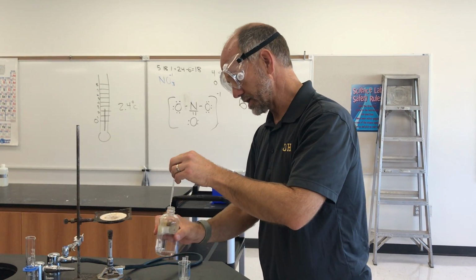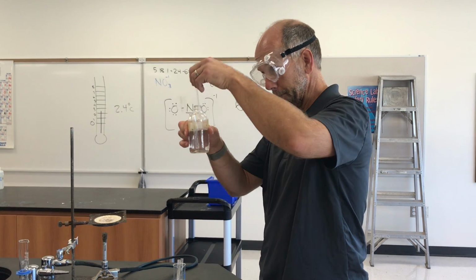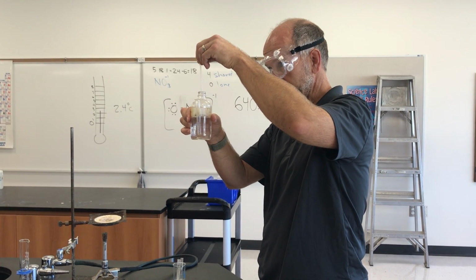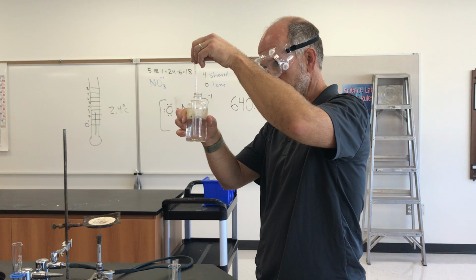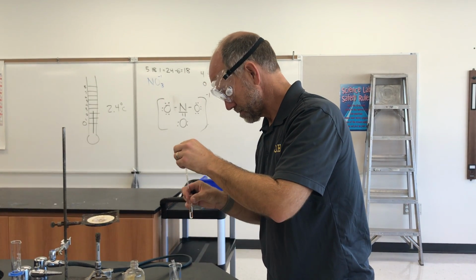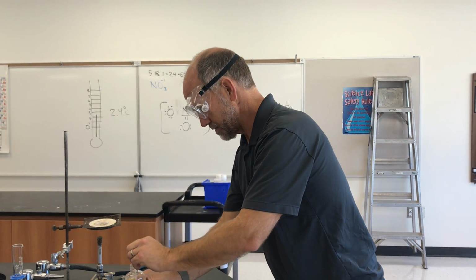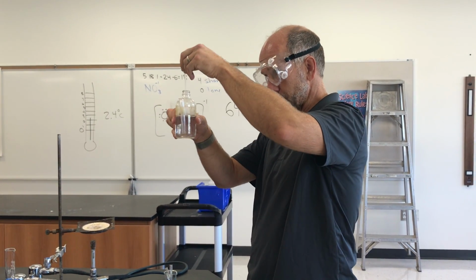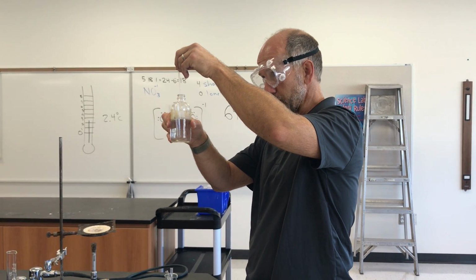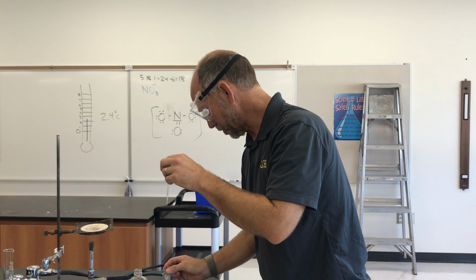And again, we'll do that 2 more times as well. There's our 2nd milliliter. And then finally, our 3rd and last milliliter of sulfuric acid.